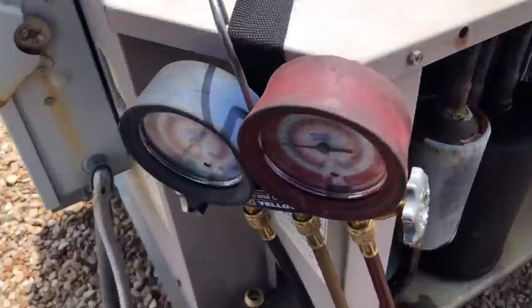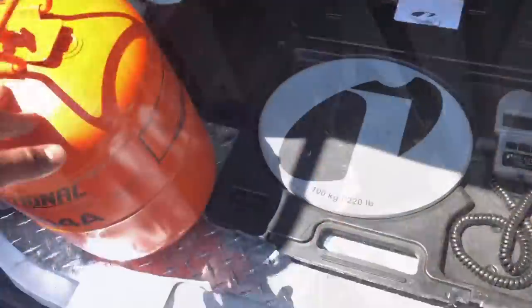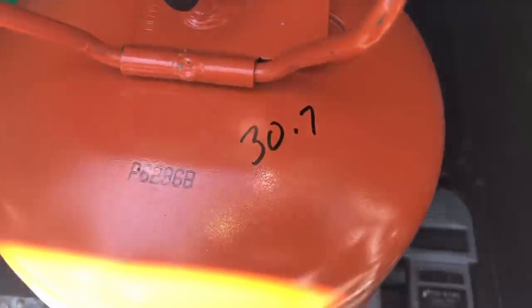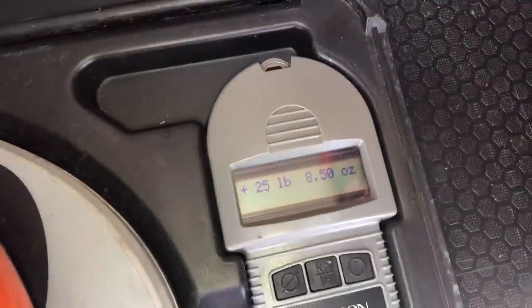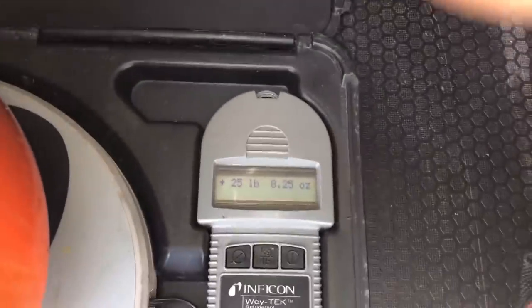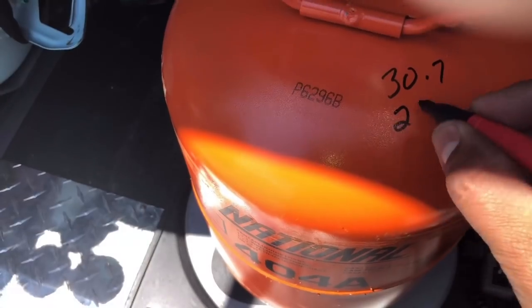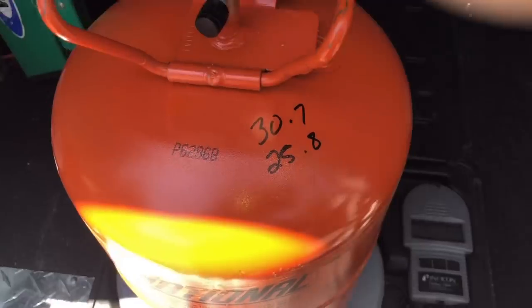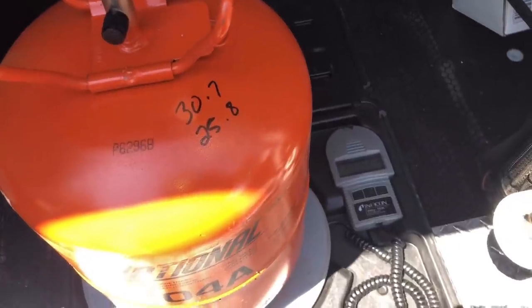Now we can go ahead and open this up and get the system running again. Zero out your scale and weigh your tank. This tank weighed 30 pounds, 7 ounces. Now we're at 25 pounds, 8 ounces — so we added about 5 pounds of gas. That's not bad. Now we're just going to continue on, go do the leak search inside, and we'll be good to go.